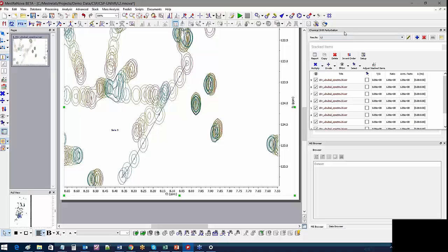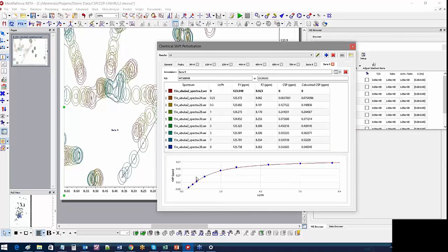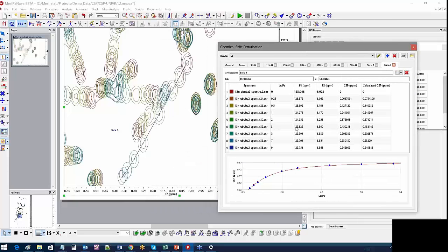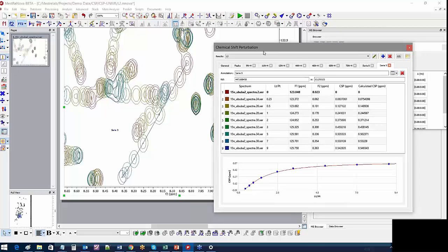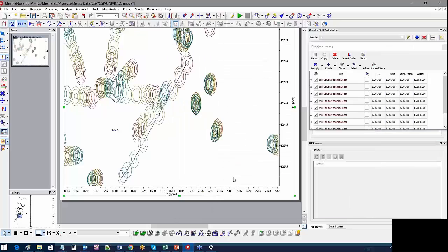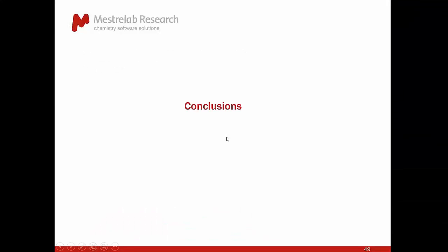And as I can show you, this is done in real time. So you get a much better curve of those titration points. And the KD from there is this number, and with that deviation, that error. So yeah, I hope this gives you an idea of this fully automatic processing of multiple CSP data, and also you can manually correct that. Now back to your slides.